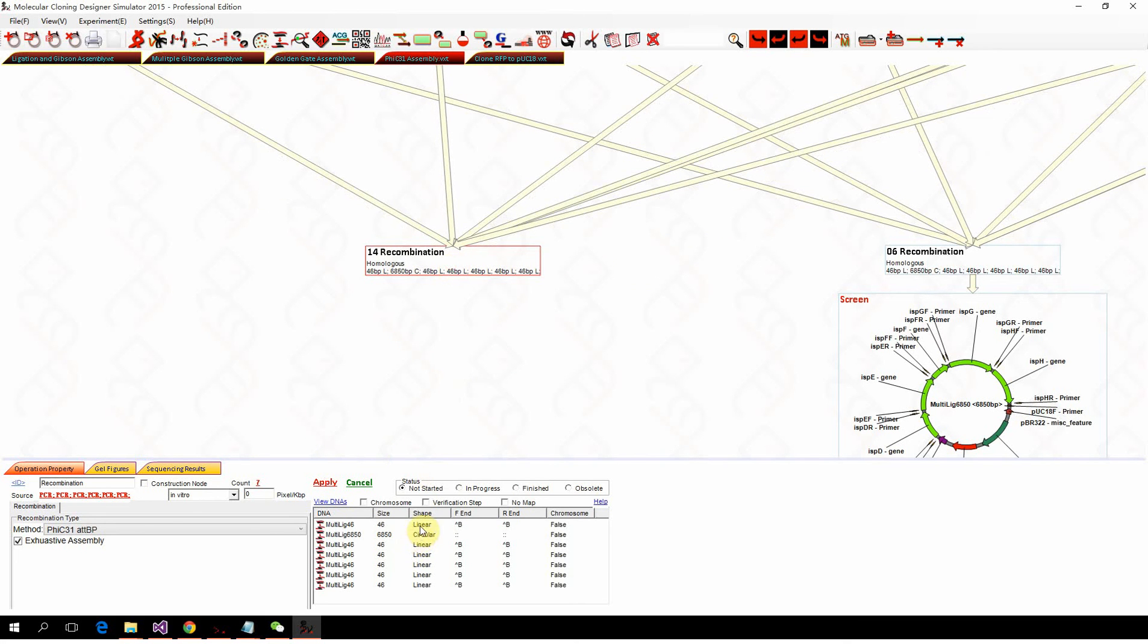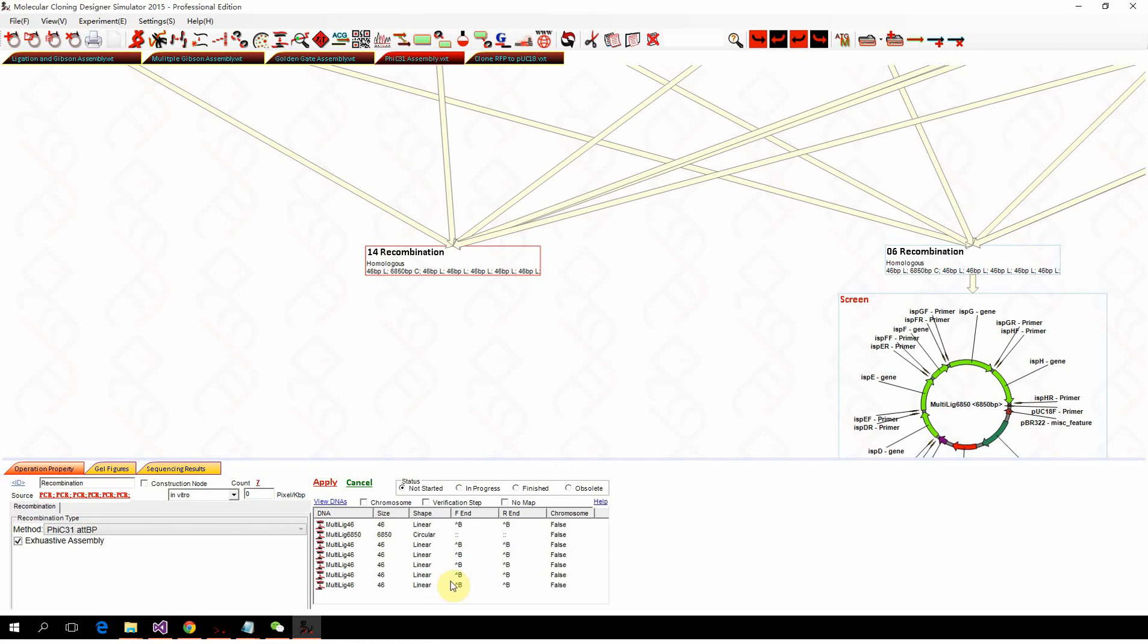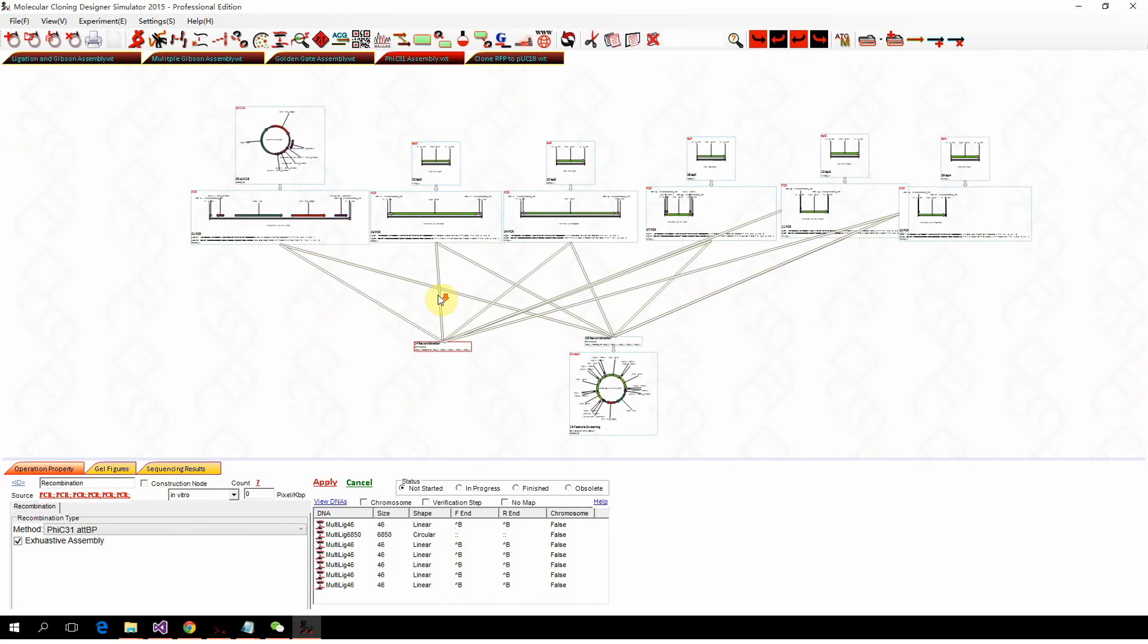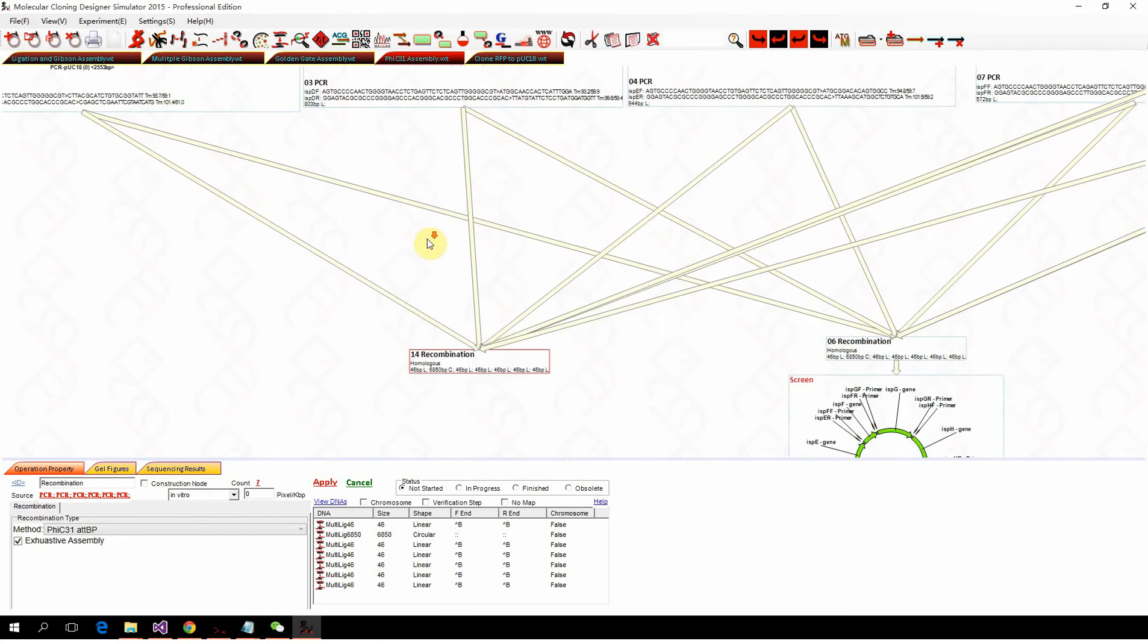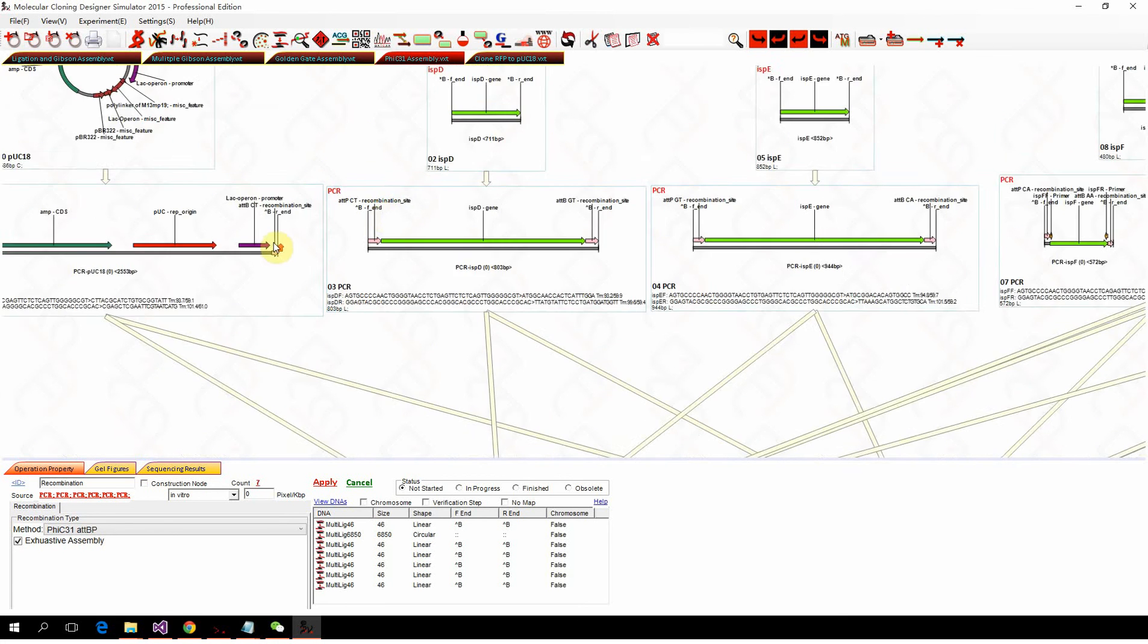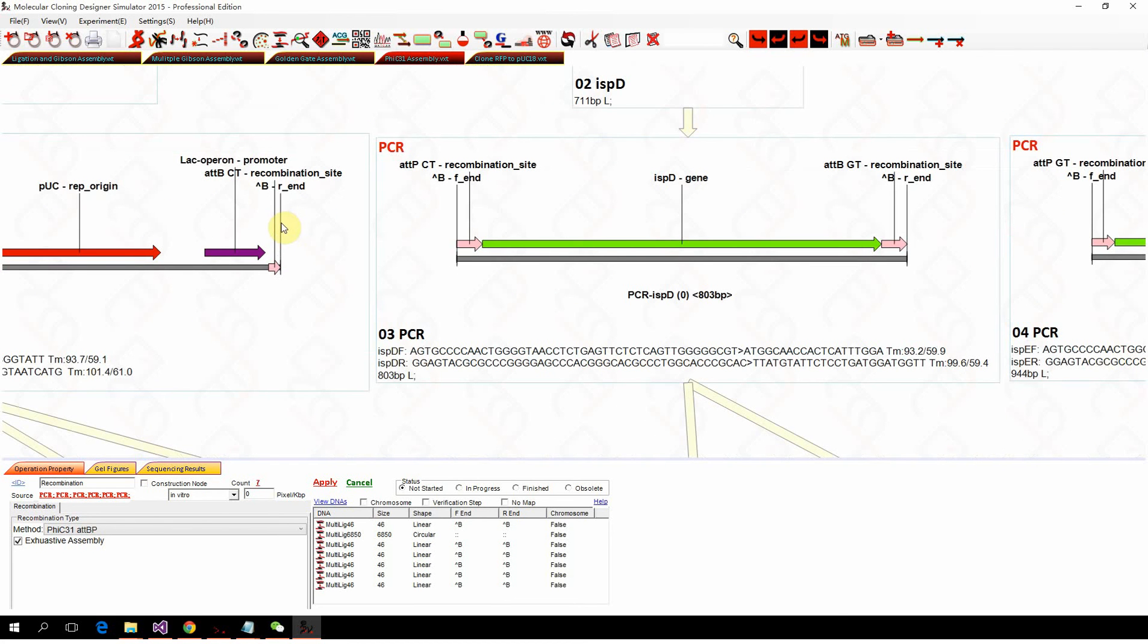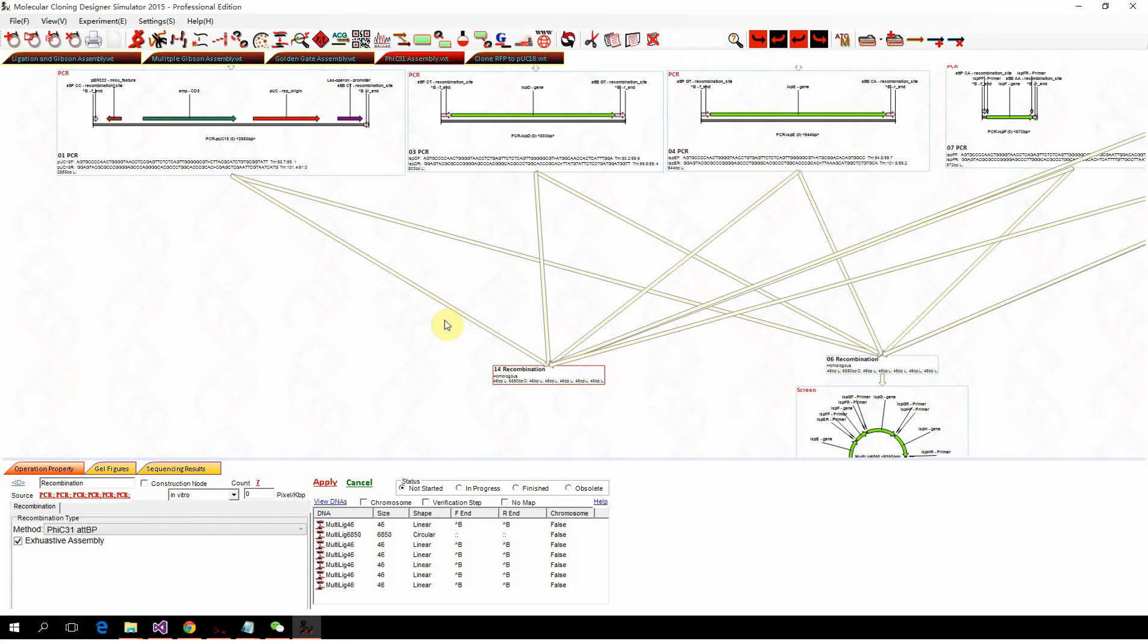You can see that it assembled the 6.85 kb circular fragment, which is the one we want. There are also the six 46 bp linear fragments, which are the residue recombination sites. Because after recombination the BP will become L and R, those ones are either the L or the R, which are the byproduct.